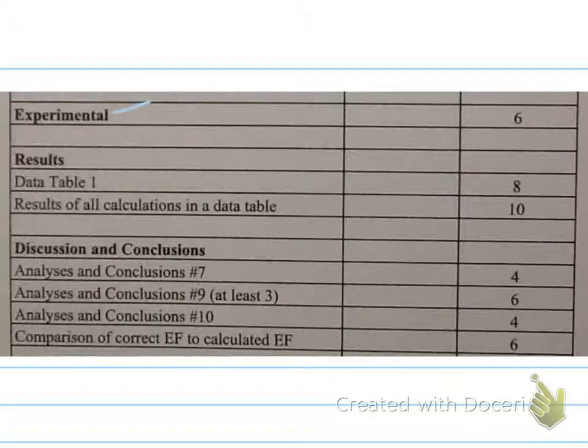Experimental, remember these are the steps that you follow to do the procedure. So again, you're going to summarize the procedure. Probably not going to write out all of those steps. Again, you're probably going to summarize the steps.